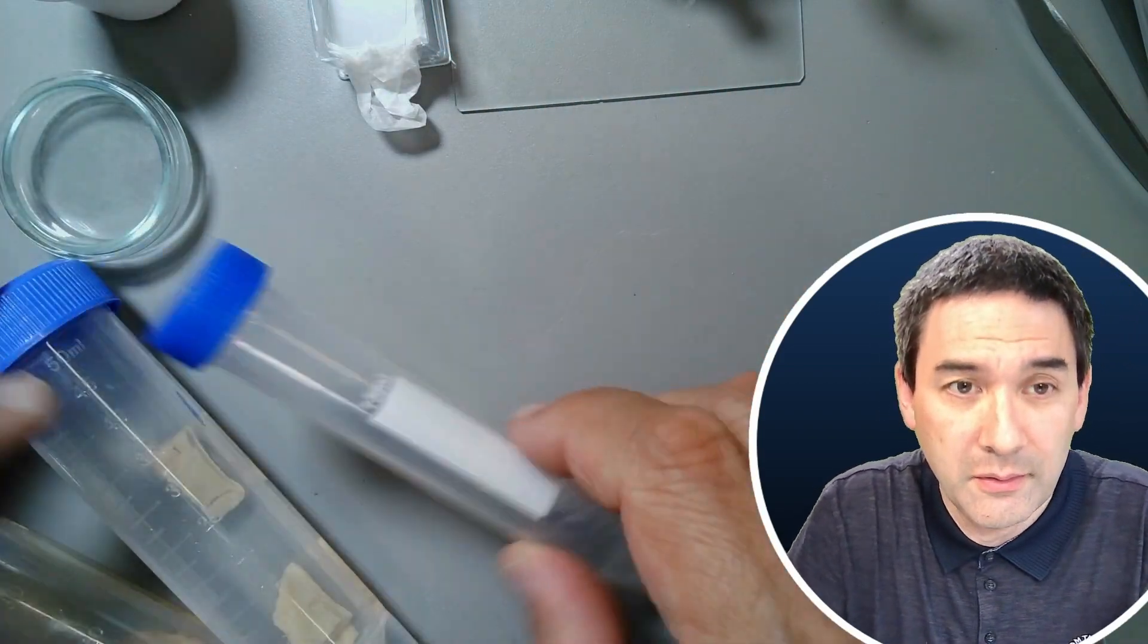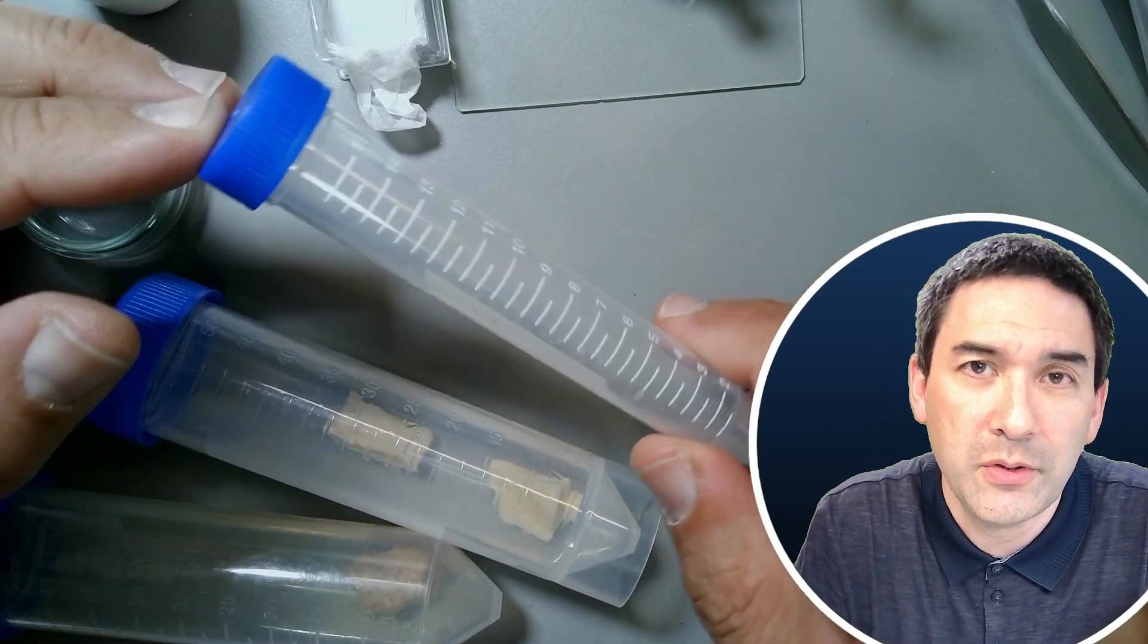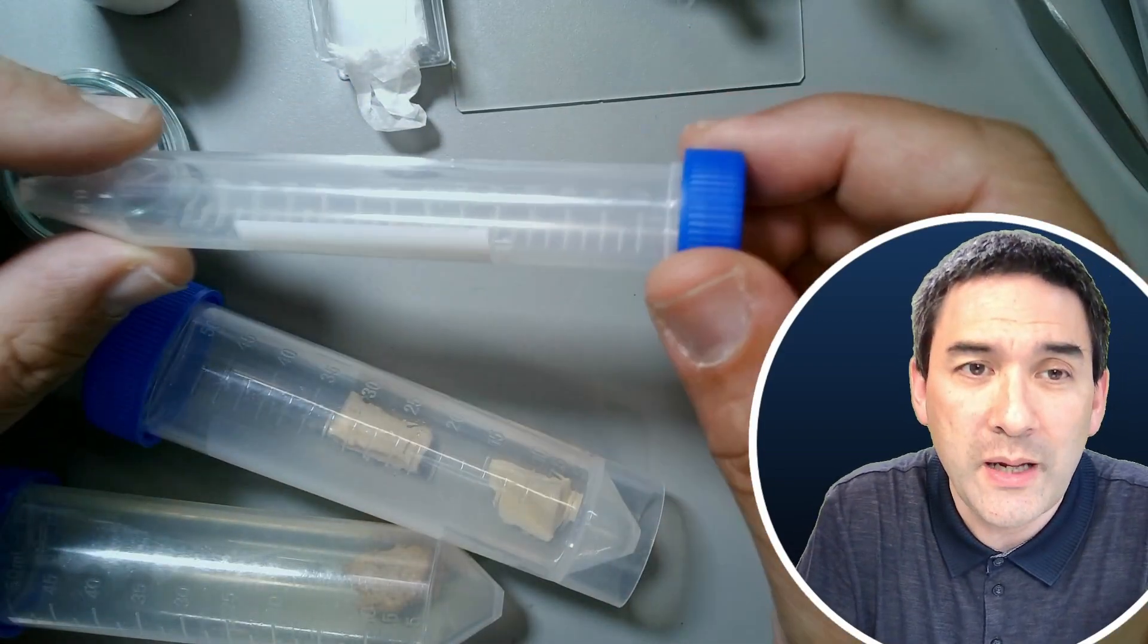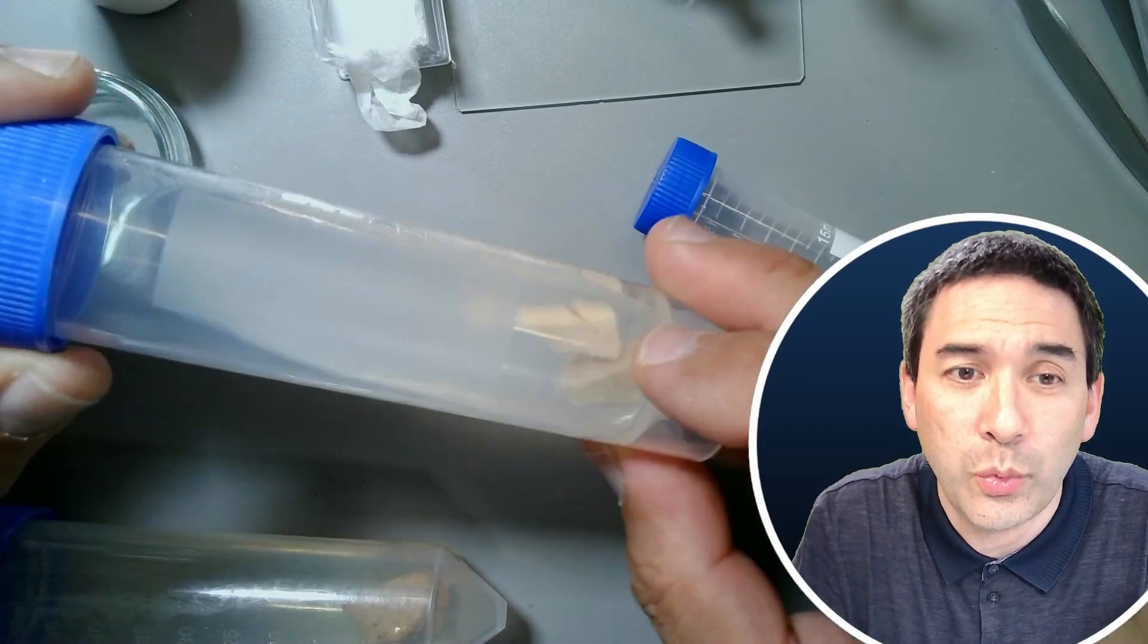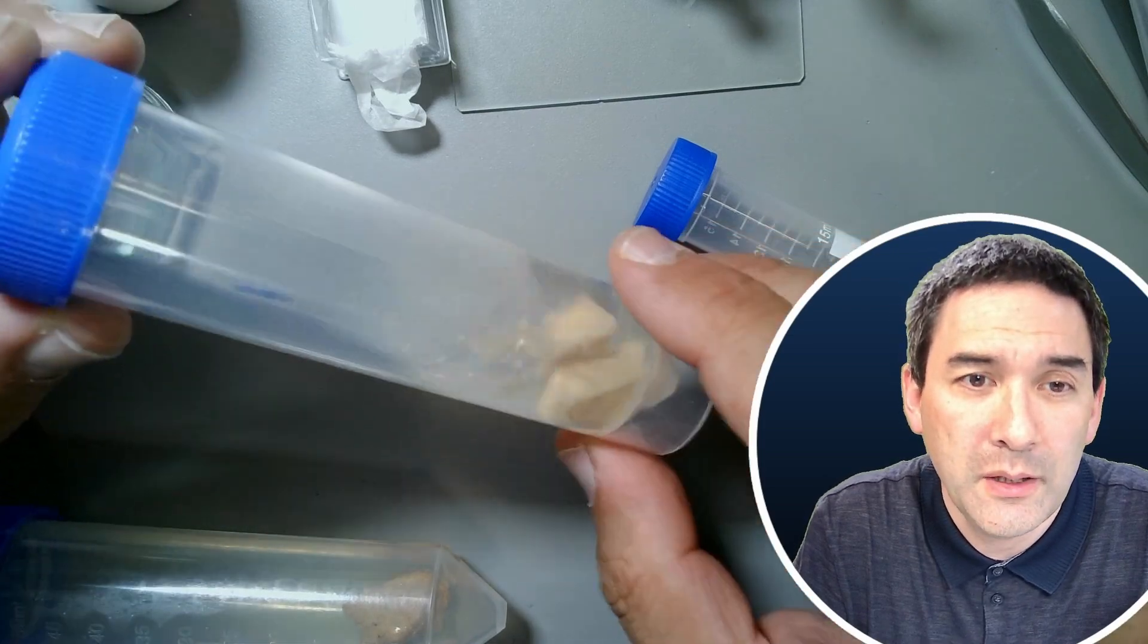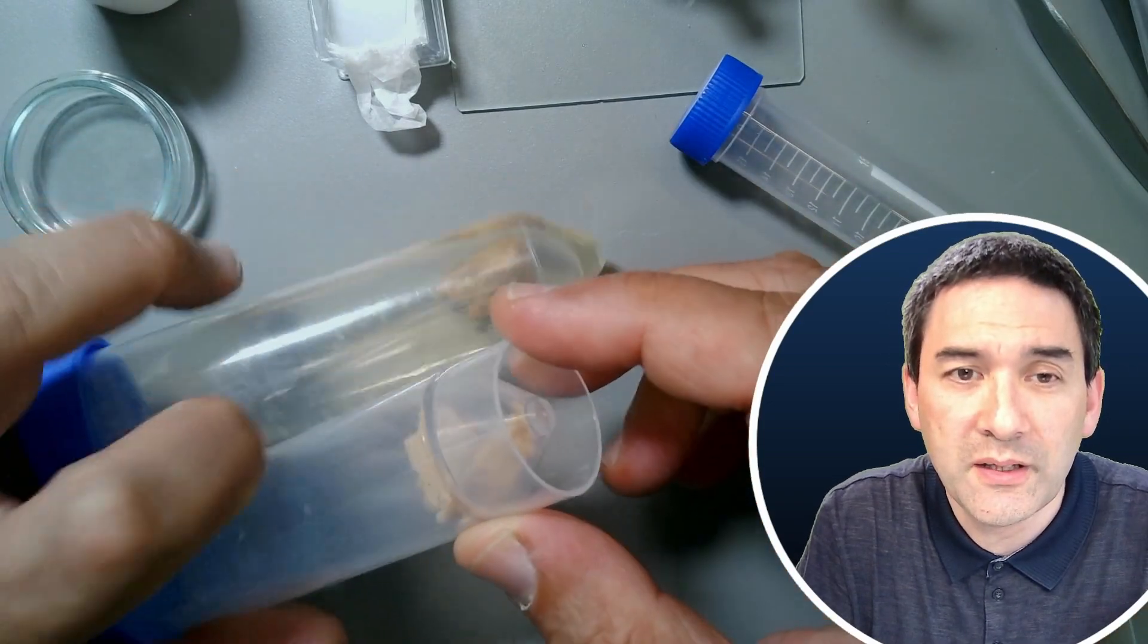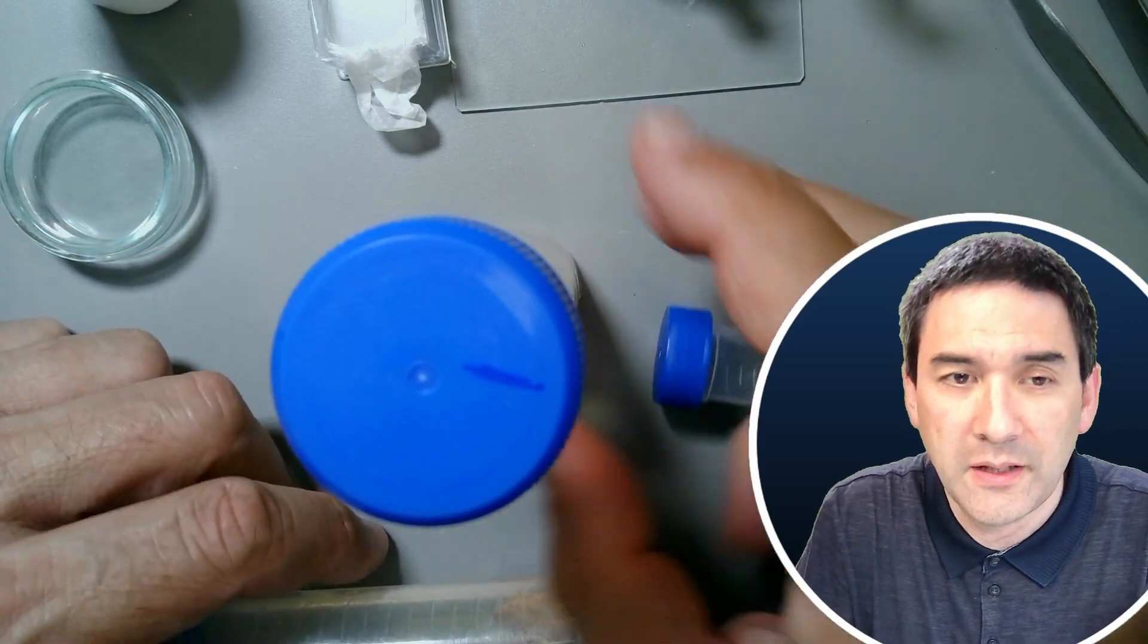Next, I'd like to talk about some specimen containers. There are a couple I'd recommend. These are so-called centrifugation tubes. You can actually use them to centrifuge something, but I think they're very useful for storing specimens. One reason I like them is because they are tight. In this case, I've got alcohol in here to keep the specimen for a longer time. You can see they're actually pointed here. These are the same except they have a flat bottom. I actually prefer those because you can stand them up.